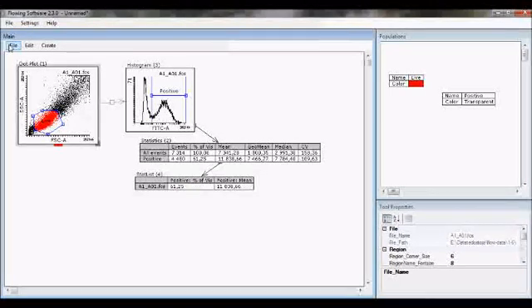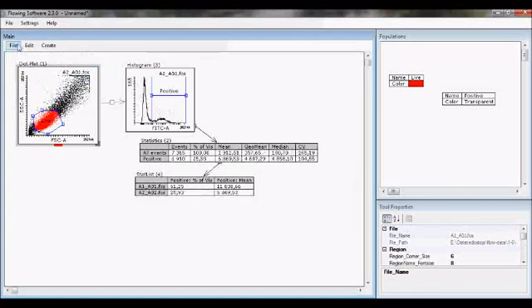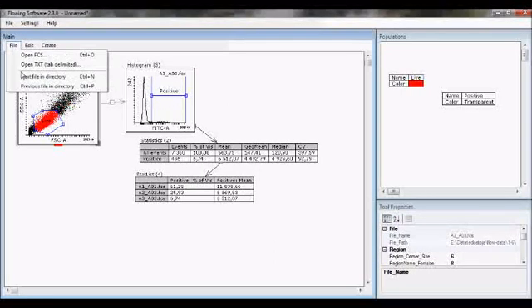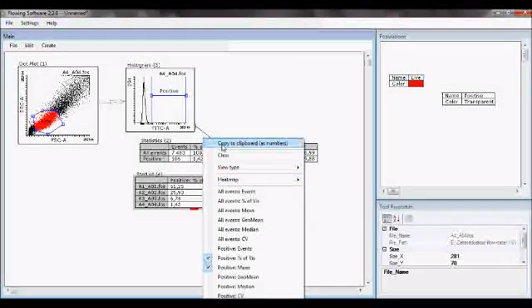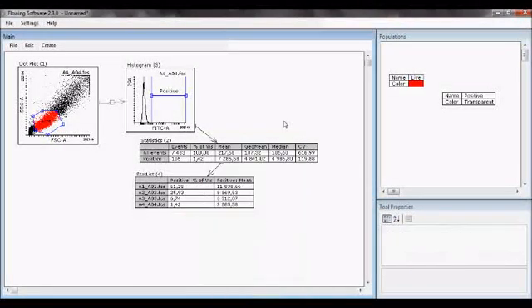Now when I jump to the next file, and the next file, and the next file, you can see that it collects all the files and only those numbers I have selected. And this can be copy-pasted to, for example, Excel for reporting.